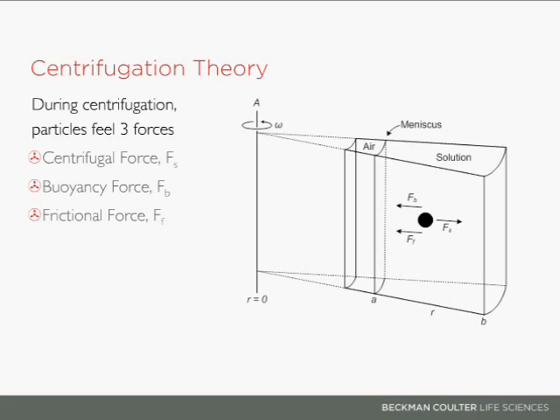And finally, there's a frictional force or frictional drag that occurs as the particle sediments at a given velocity. It'll experience some drag, and this is related directly to the particle's shape. The more aspherical a particle is, the more frictional drag it will incur.